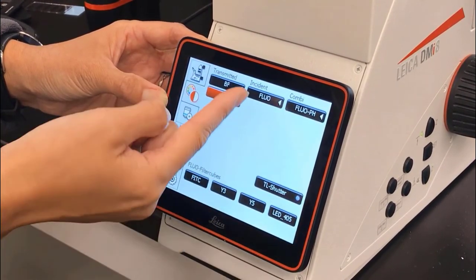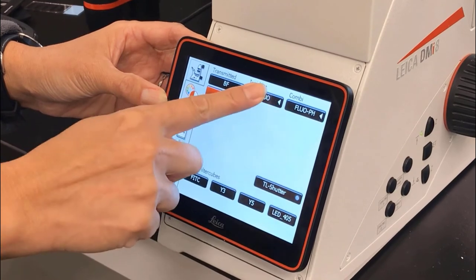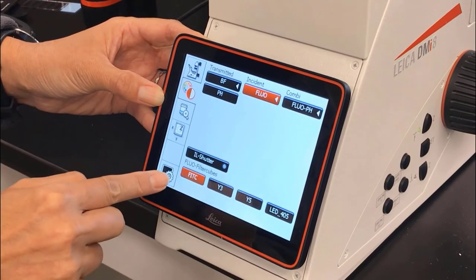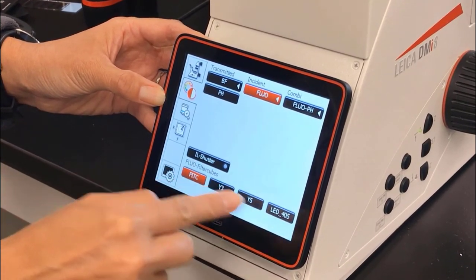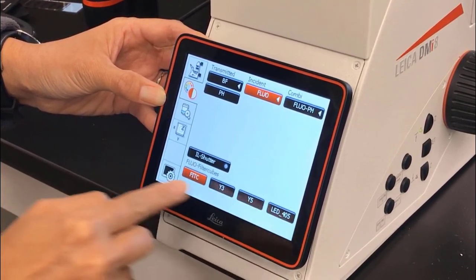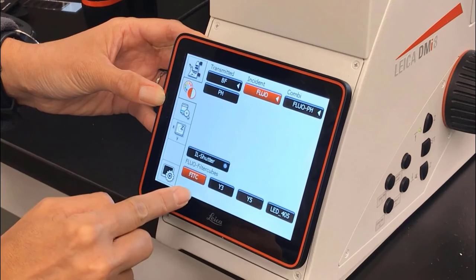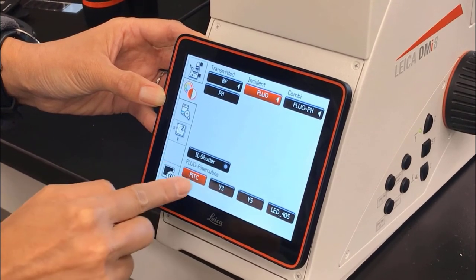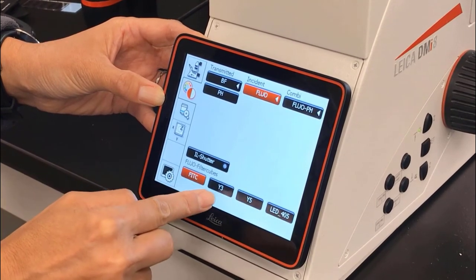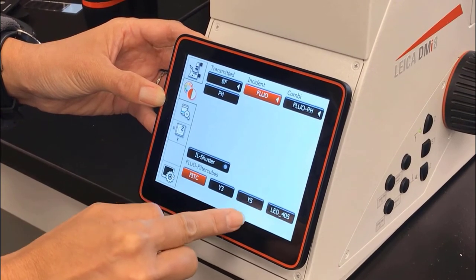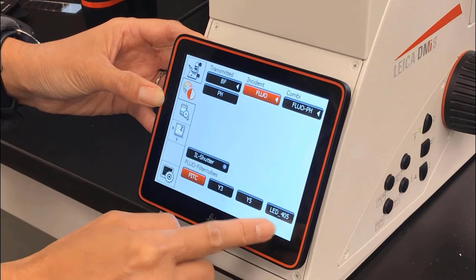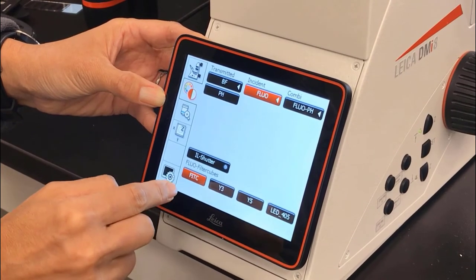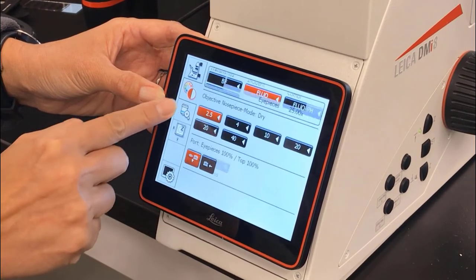If we switch to the fluorescence incident light method, we can see that the filter cubes are now available to us. We can choose between FITC, Cy3, Cy5, or LED 405, which you use for DAPI.